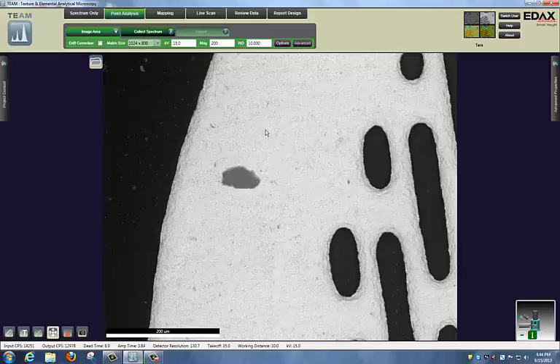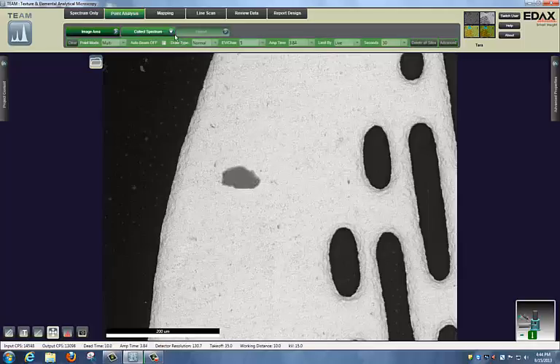With our image available now, we're able to define the areas where we want to collect our data from. If we don't define any areas, the default will be to collect the spectrum from the entire field of view. The options associated with Collect Spectrum are multi-point or single point. You could turn the beam off, so if you have a large multi-point set, it will automatically turn the microscope off after the collection is completed. Draw type normal includes spot or reduced raster mode, or free draw, which is a free-form draw.